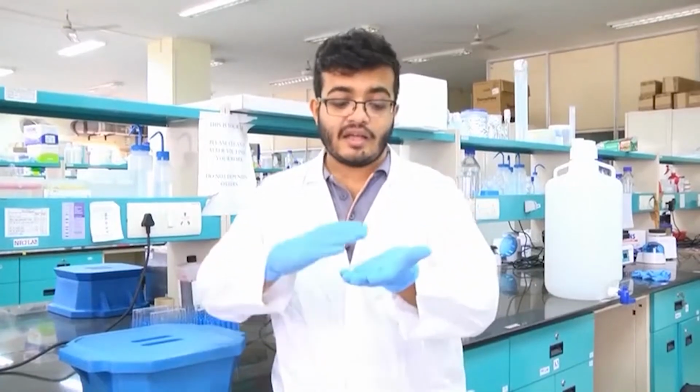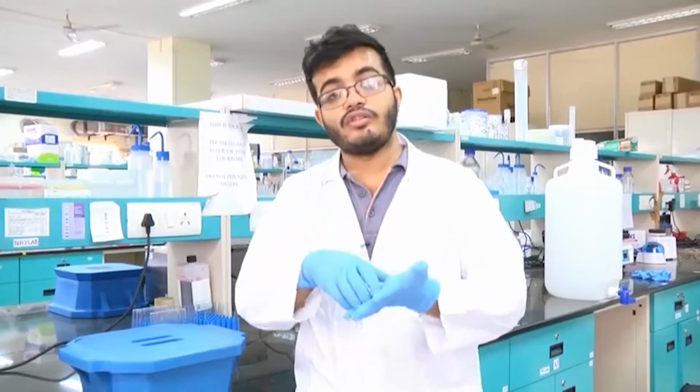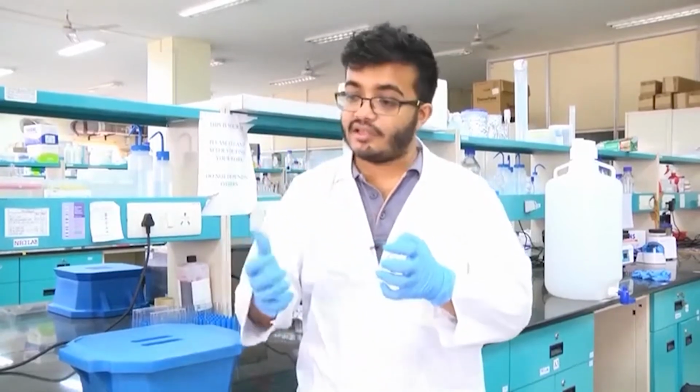During this time, they will start expressing the antibiotic resistance gene, and after 1.5 hours, we will take LB agar plates containing the appropriate antibiotic, and onto that we will take say 20 microliters of that LB broth and plate them. We keep them in a 37 degree centigrade incubator overnight, and the next day you should get colonies, which contain bacterial cells carrying the plasmid which you have prepared.